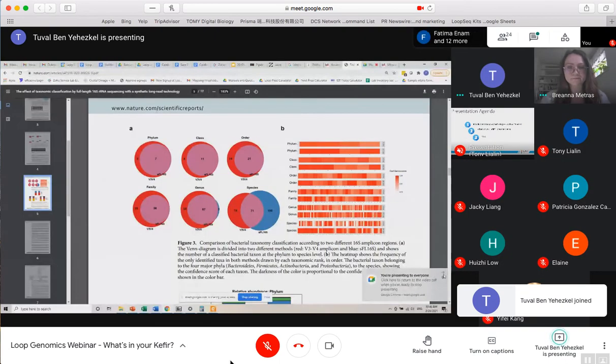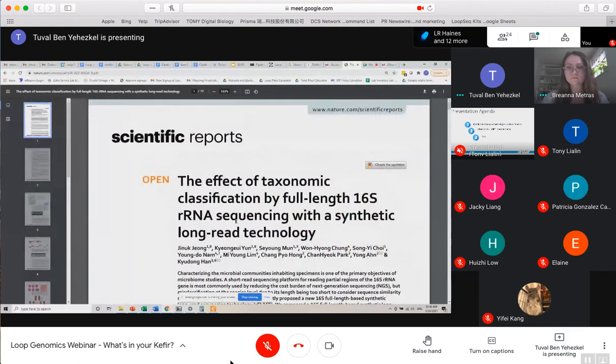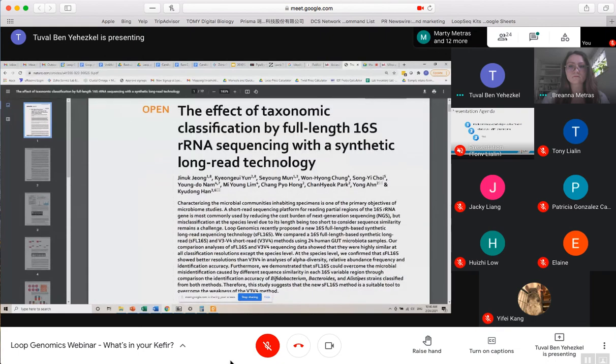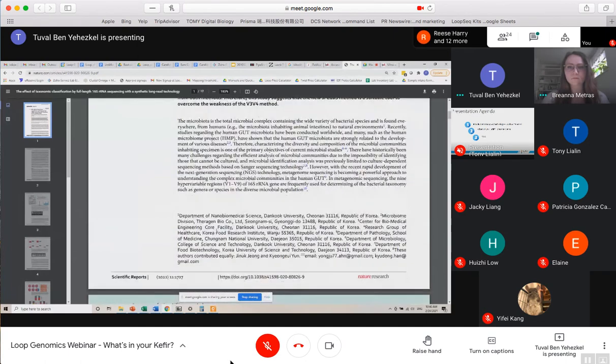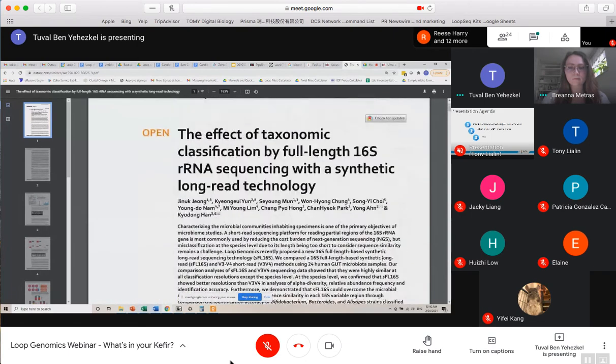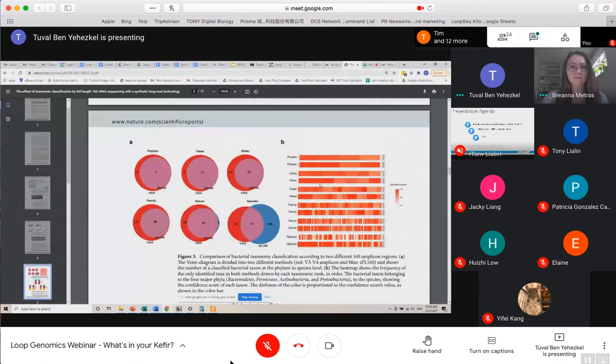Can you see my screen? Yes. All right, so this is from a paper published a couple of months ago in Nature Scientific Reports, the effects of taxonomical classification by full-length 16S ribosomal RNA sequencing with synthetic long-read sequencing. This is a group, if I'm not mistaken, out of Korea that used our technology for various types of microbiomes. And if you scroll down to figure 3 here, basically they show at different taxonomical levels the effect of classifying using short read V3, V4 or long reads.